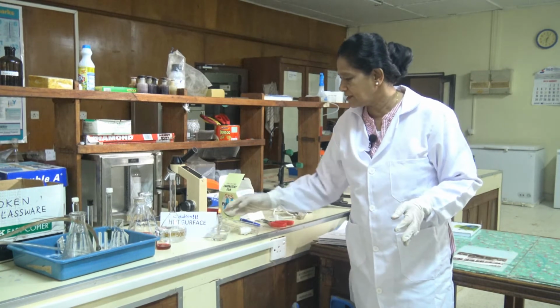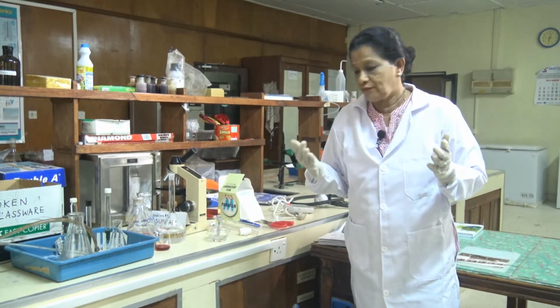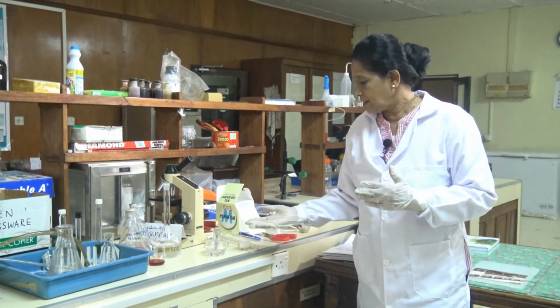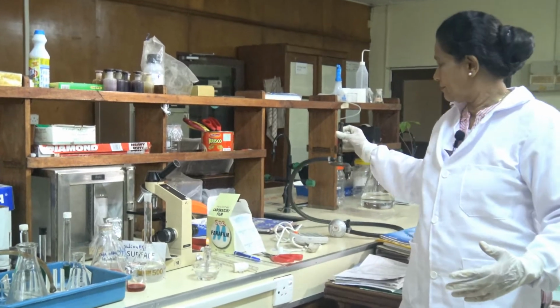Next, the material we use in the laboratory is flame. We can get flame either by using a spirit lamp or through a Bunsen burner.